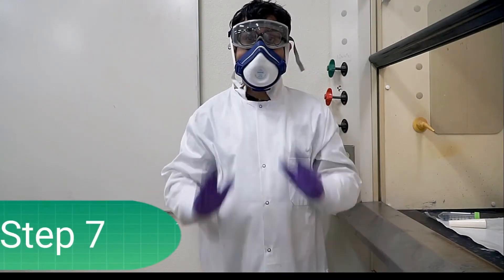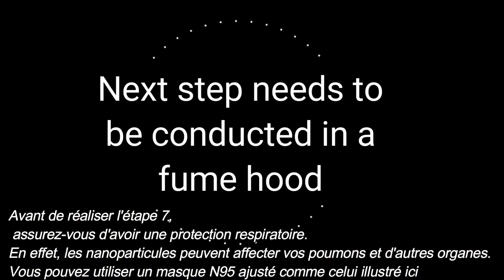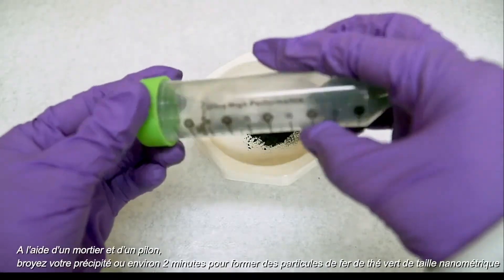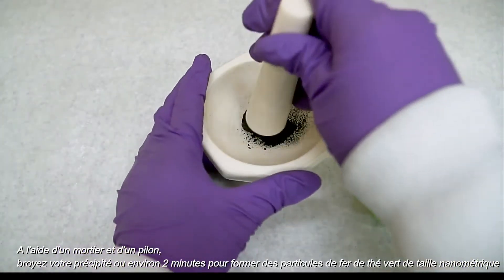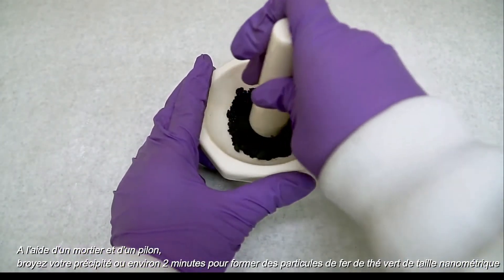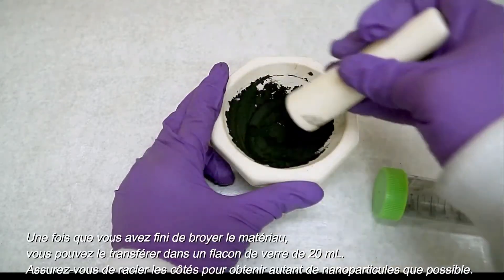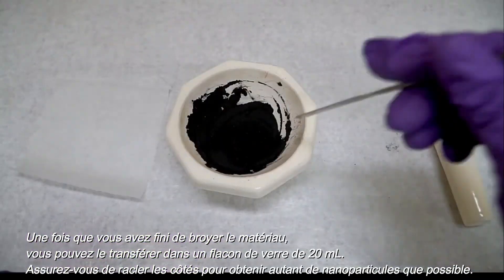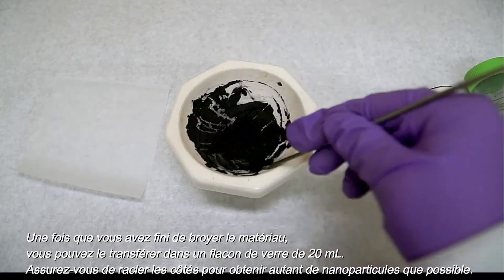For step 7, you will want to ensure you have respiratory protection as nanoparticles can affect your lungs and other organs. You can use a fitted N95 respiratory mask like the one shown here. Using a mortar and pestle, grind your precipitate for roughly 2 minutes to form nanoscale zero-valent iron nanoparticles. Once you are done grinding your precipitate, you will transfer your nanomaterial to 20 milliliter glass vials. You will want to scrape the sides to ensure you collect as much of your nanoparticles as possible.